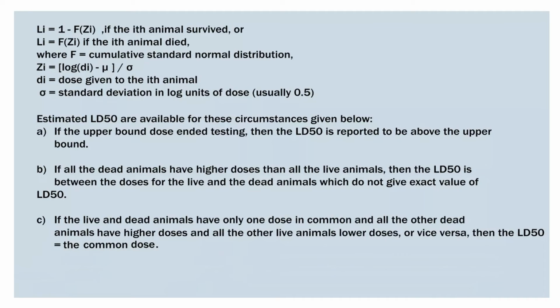Estimation of LD50 available for this circumstance is given below. If the upper bound dose ended the test, then LD50 is reported to be above the upper bound.